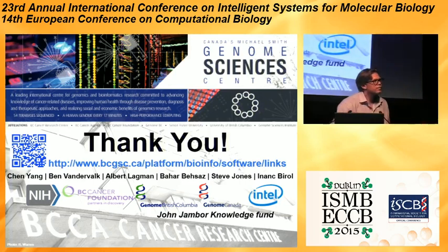Very nice work, and I have a question. Maybe I'm misunderstanding, but usually in de novo assembly, we use assemblers, especially de Bruijn graph-based assemblers. They may use very long k-mers for assembly, and due to the very high sequencing error of long reads, you may use shorter k-mers. So what will happen if the short k-mers match, for example, multiple contigs?